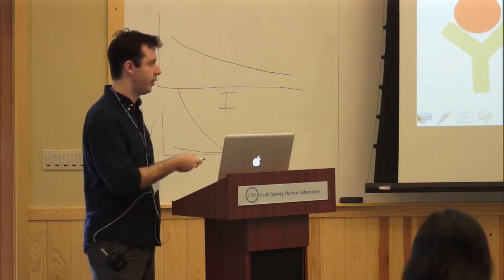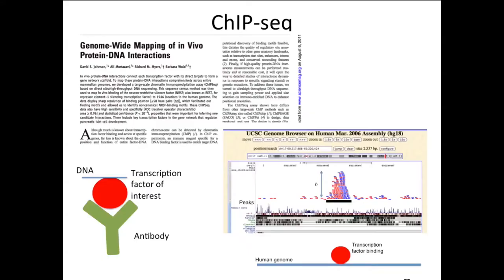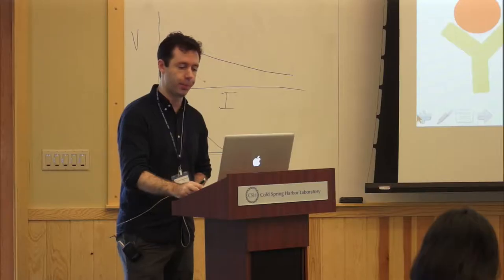Right. That's right. So basically, this is one illustration of a binding site for a protein. As you can see, lots of reads that have been pulled down together with DNA, the protein of interest, recognized by the antibody, mapped back to the genome and forming a peak like this. We'll also go back to peak detection, not in this lecture, but in the lecture on Thursday.